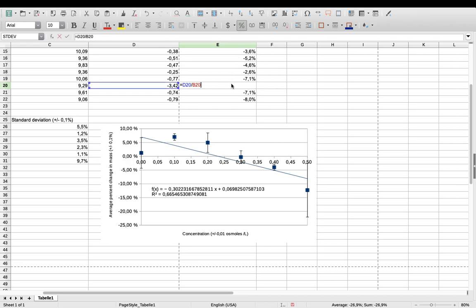I'm just going to put in here an asterisk, if I can find it. I'm just going to put in -27, what was it, 26.8. I'm going to use a point, and that way it doesn't recognize it as a number. Oh, it's not working now. I can't calculate with that. Let's see here. Oh, no, that did work.